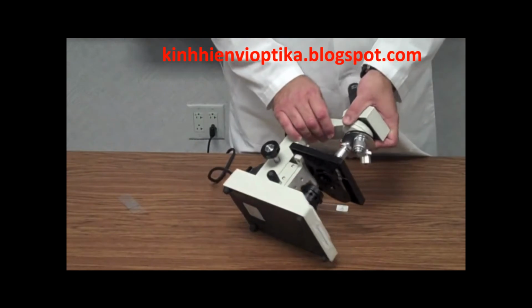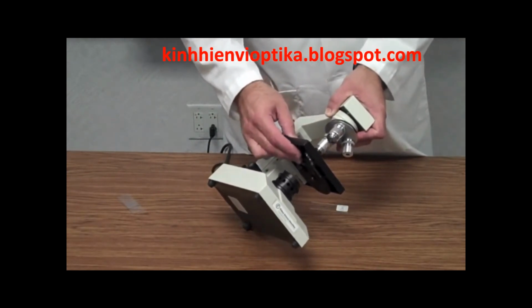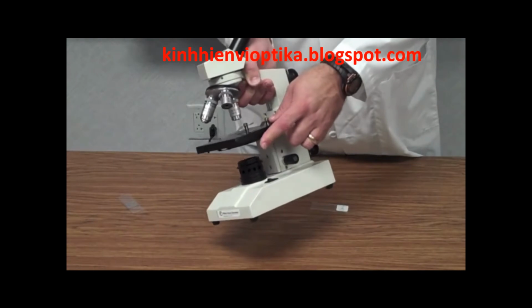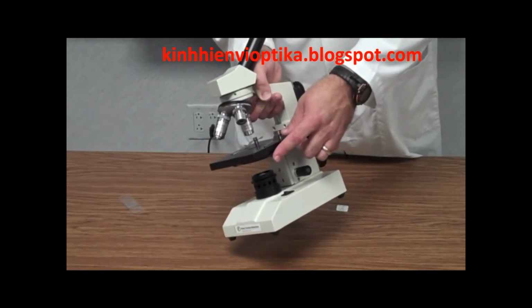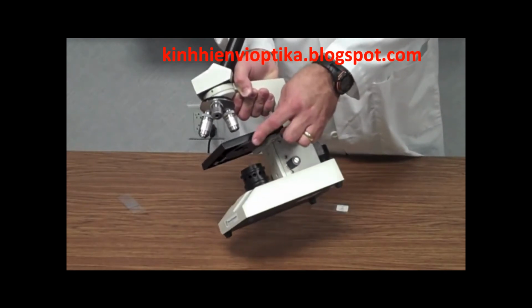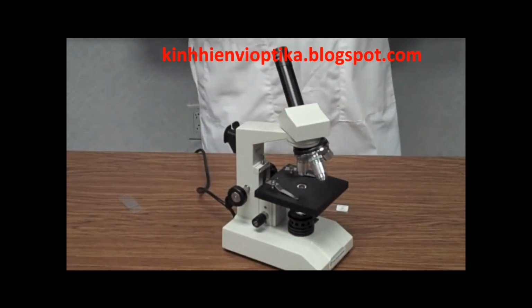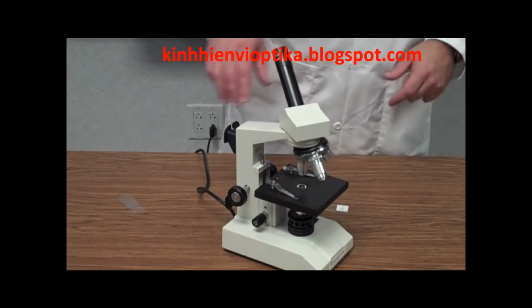Below the stage, and we always forget about this because it's kind of out of sight, is this little dial. Okay, this little dial right here that rotates is called a diaphragm. It has 5 different size holes in it that allow different amounts of light to shine through the stage. Sometimes you want to use more light to help you see an image. Sometimes you need less light. Sometimes too much light can drown out the image and it makes it harder to see.